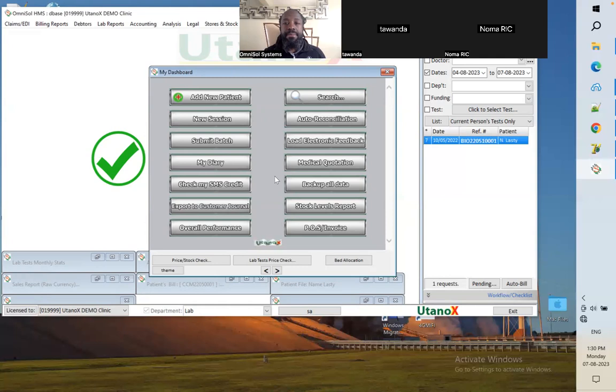Okay, so do we need internet when we have this desktop? Yes, but you don't depend on it. That's the difference, you see. If you didn't have internet, you'd still be able to operate and function, but you'd be missing out on things like real-time synchronization and remote access to results for your providers.